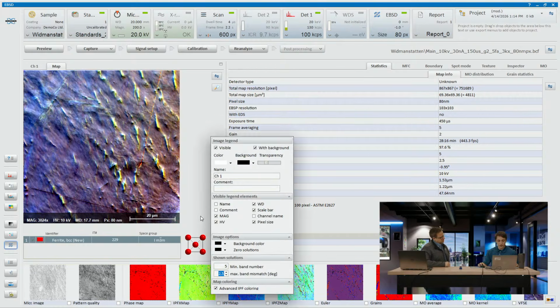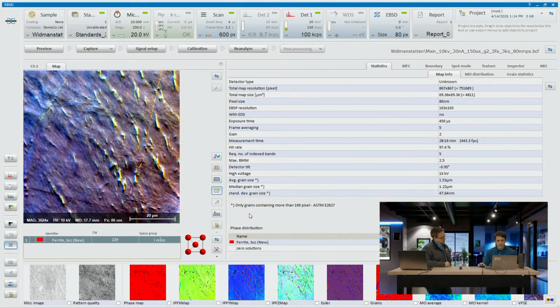What we're doing is looking at a particular section of the detector. We are splitting the detector into a red, a green, and a blue channel, sort of like channel 1, 2, 3. Depending on where each of those electrons is landing on my detector, I can get a view into the topography of the sample, as well as crystal orientation, very quickly.